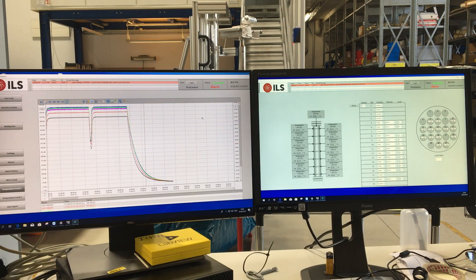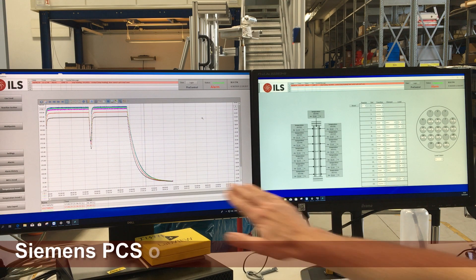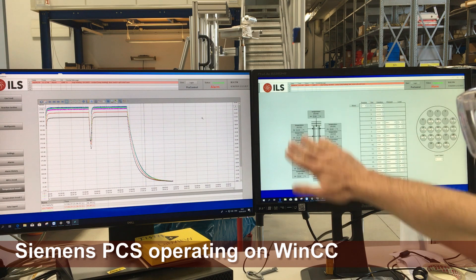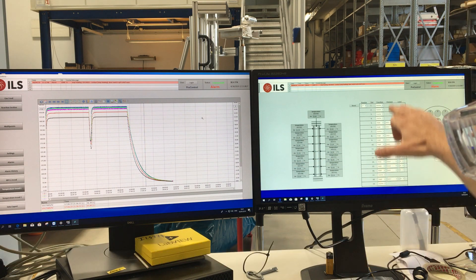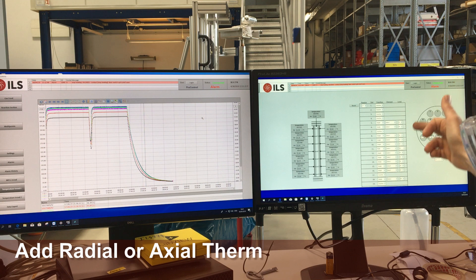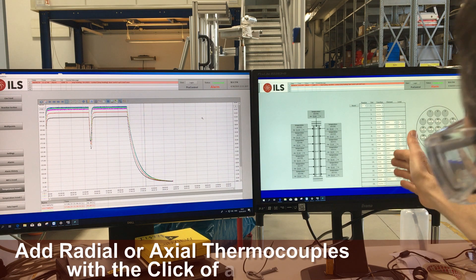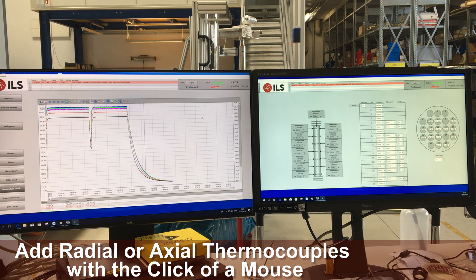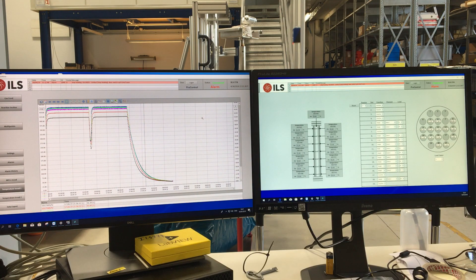As promised, I'll give a short introduction to the software used here. We're using a Siemens process control system with a WinCC operating system. One of the most difficult parts of this unit was coming up with a way to show a lot of temperature curves in a way that the user could really understand them. We made this interface which allows you to activate or deactivate thermocouples, and choose between multi-point and single point thermocouples. Here you have a graphical representation of the various measurement points. By selecting the thermocouple type and entering the axial and radial position, you can create export files — these can be dumped as CSV files into Excel or whatever — providing a simple yet powerful way of showing up to 90 different temperature measurements at the same time.